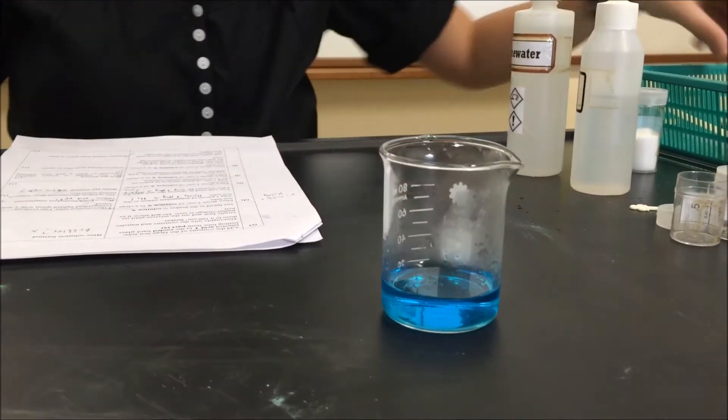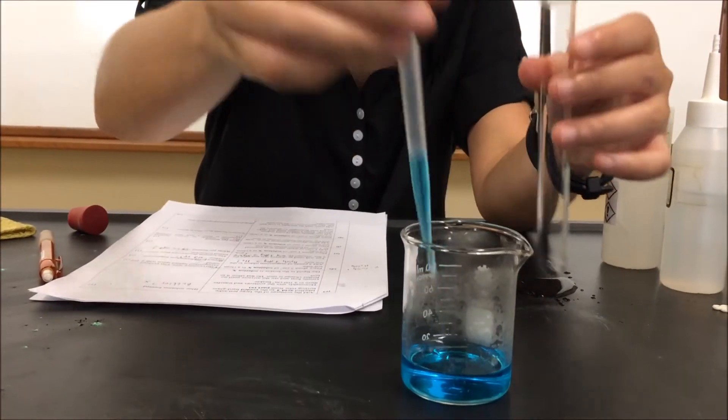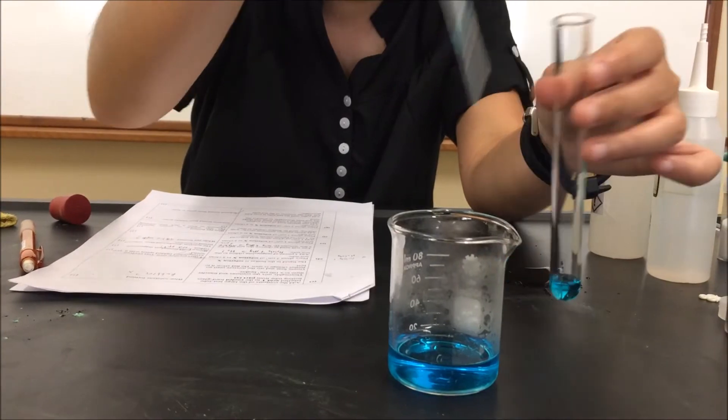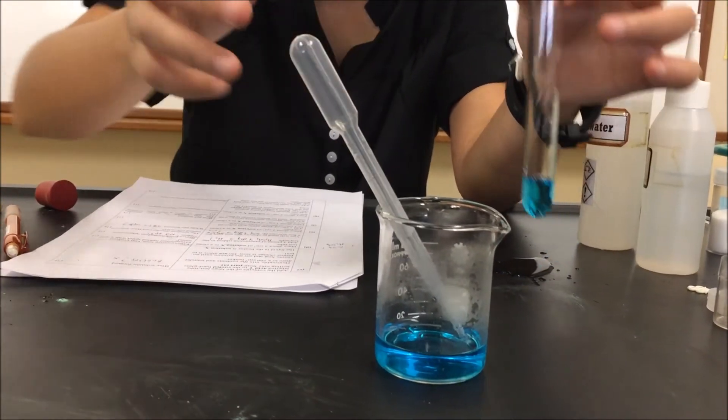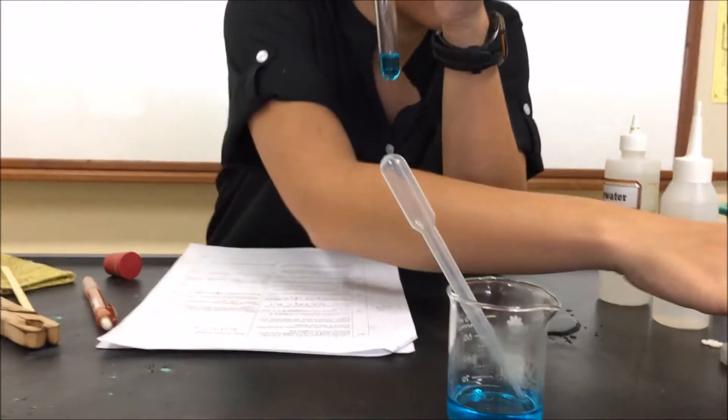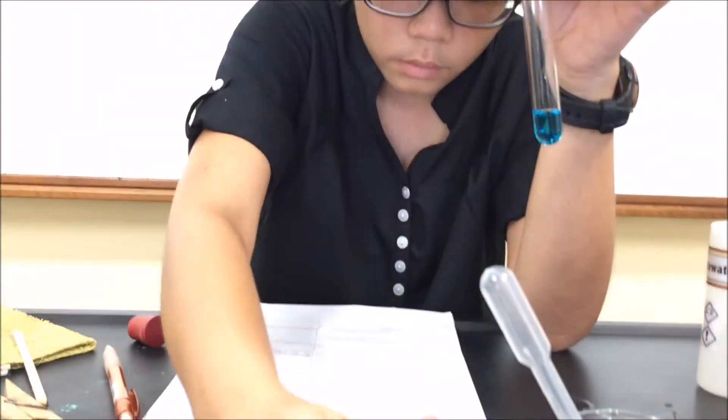We will proceed with part D where we take 2 cubic centimeters of solution Z, the blue solution, put it in a clean test tube. Next, we will add three pieces of magnesium ribbon. We understand that magnesium ribbon is a reactive metal, reactive enough to react with cold water. So we would expect bubbles.